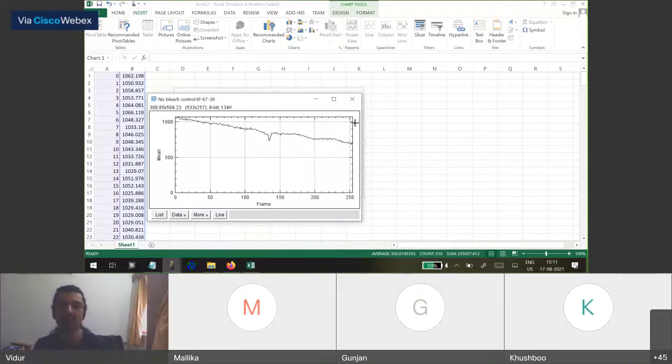Generally, practically, you will get anywhere from 10 to 40%. However, in certain cases where your fluorophore intensity is very low, you may also go down to 70 or 80%. That's why. So it's a quick and dirty way to check the settings are okay. Why are we setting the lower value to 0?